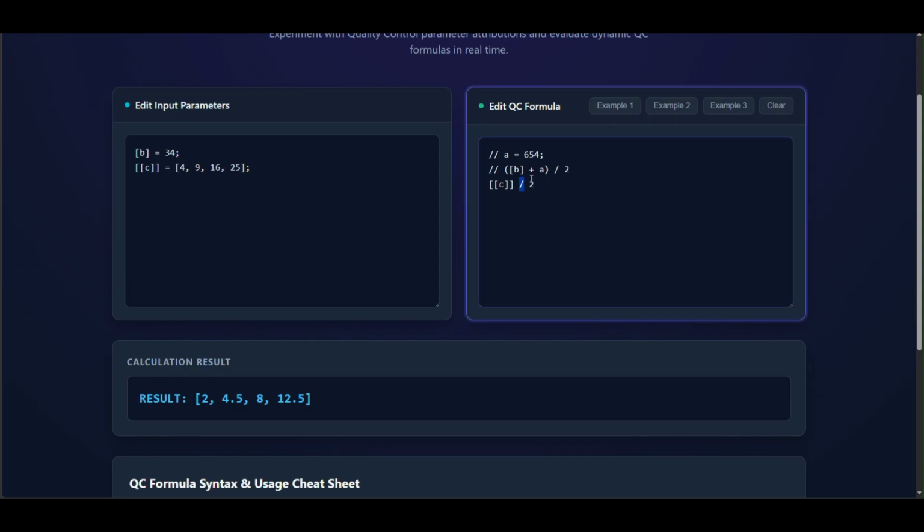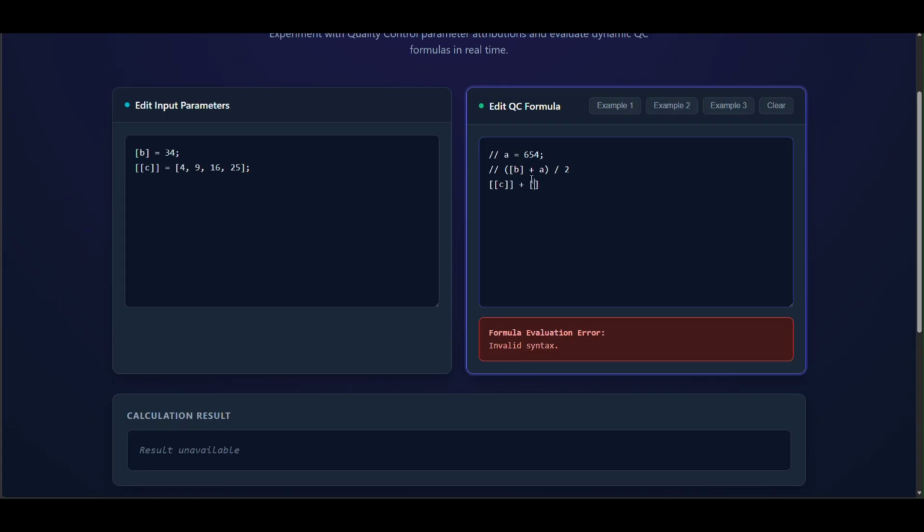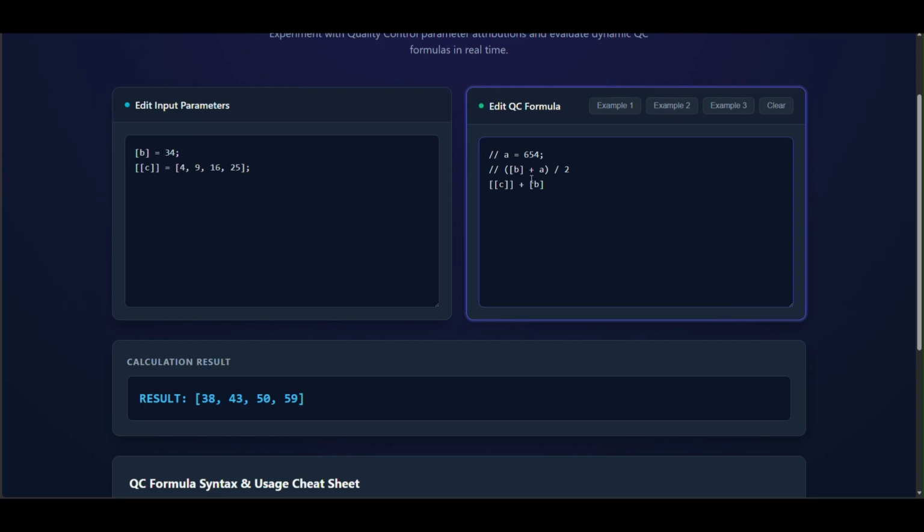We can use in this expression a scalar from parameters. For instance, to every element of the vector was added the value of the external parameter.